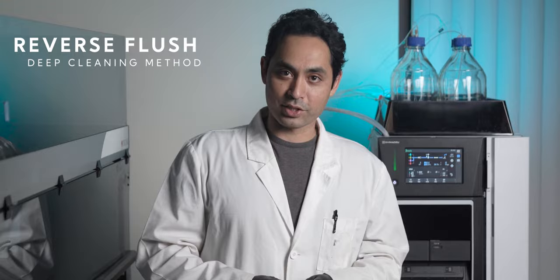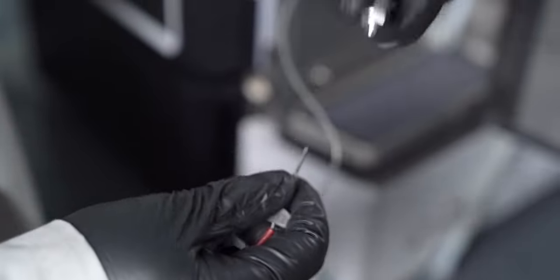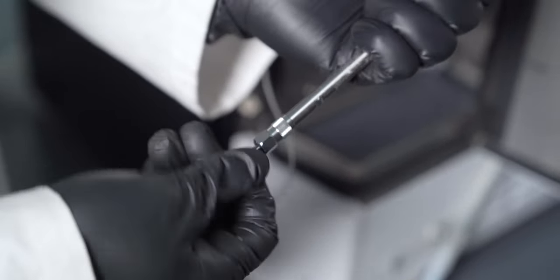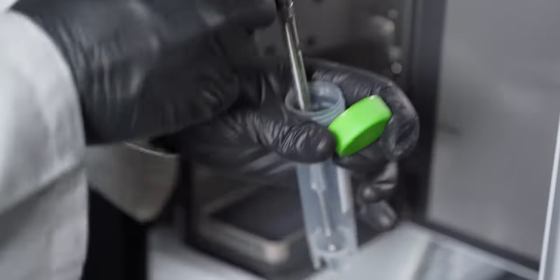If you feel like your column needs a deeper cleaning it would be best to do a reverse flush. You start by disconnecting the column at the low pressure end and then the high pressure end. Don't forget to remove the guard. Lastly, you flip the column around and you can flow into a container so you don't dirty your detector.